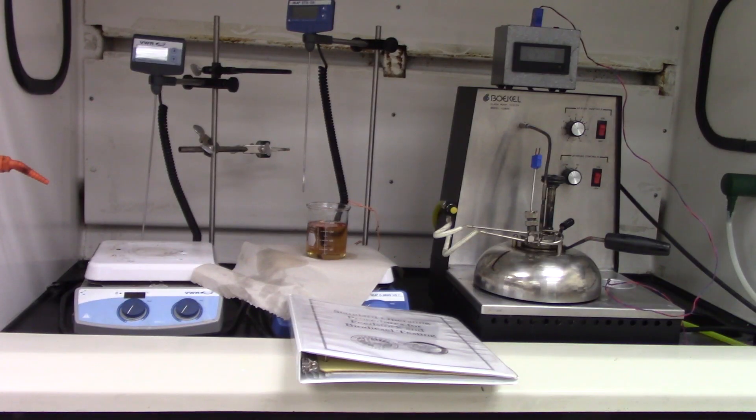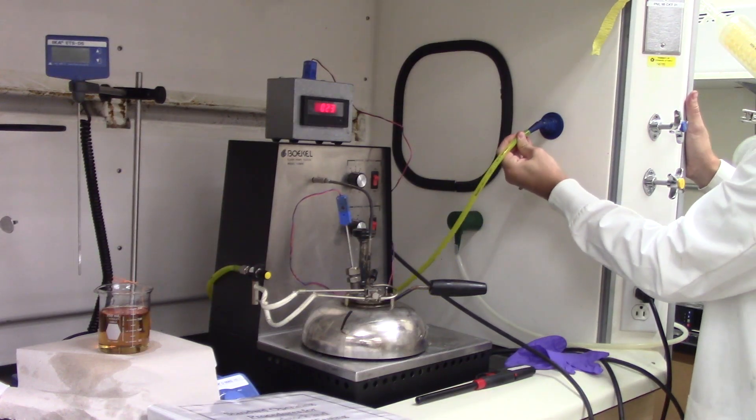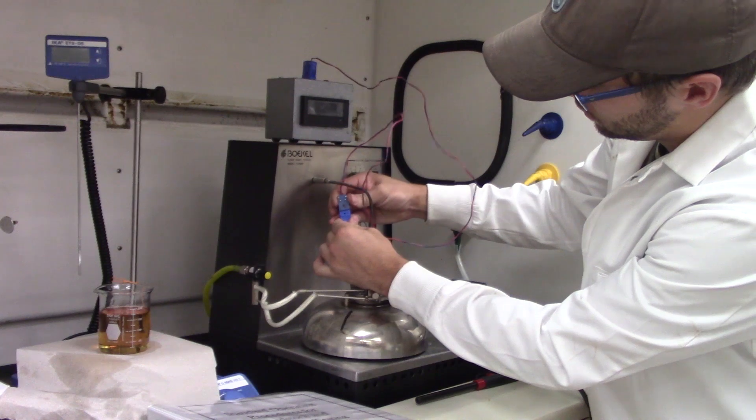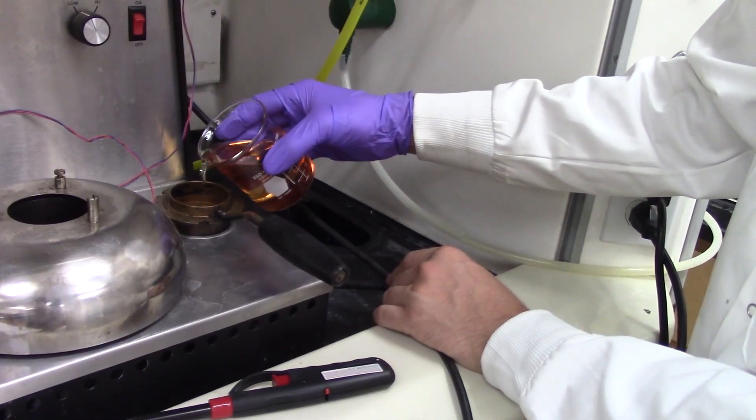To begin, we put the flashpoint tester under a hood and plug it in. We then attach the yellow hose to a blue gas outlet. We connect the thermometer cable and the digital temperature readout and turn this on. The cup is filled with sample to the fill line.